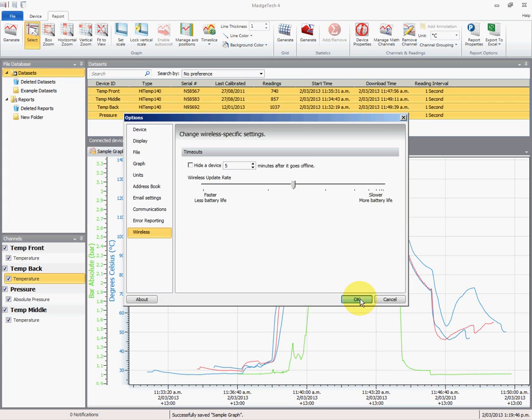So we'll select OK to save that, and that concludes my video on how to prepare a graph. Thank you for listening.